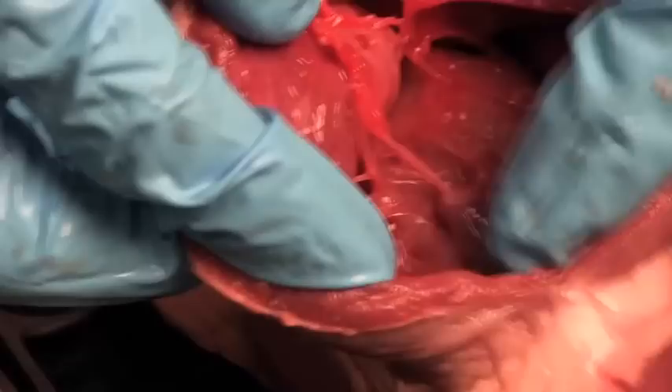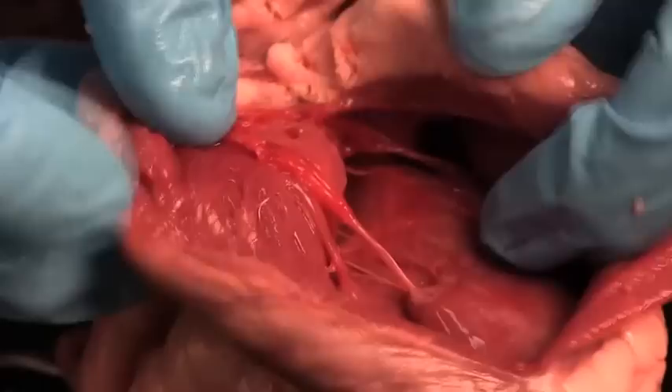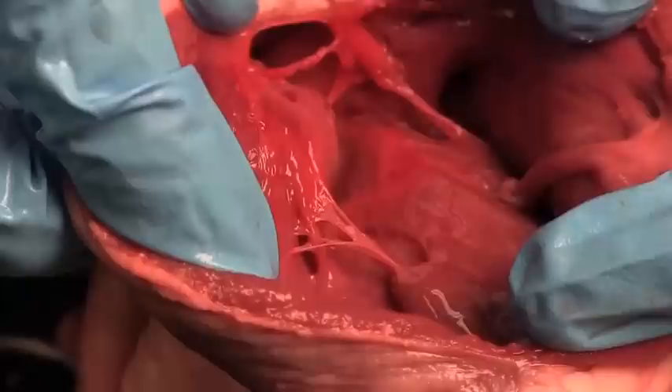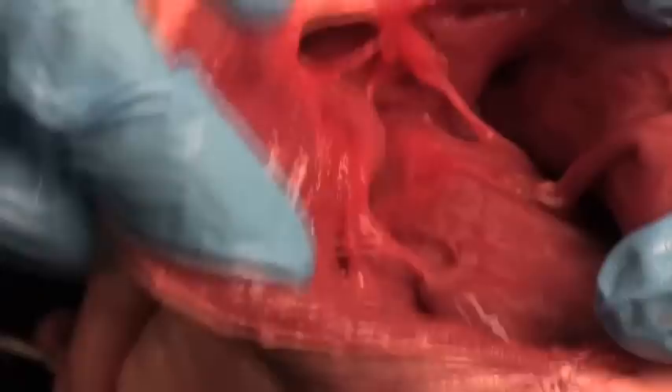Right here you can see some papillary muscles. I'm going to trim this so we can see a little better. You can see a papillary muscle that the chordae tendineae are attached to, and this one has got three little parachutes — one there, one there, one there. We call this the tricuspid valve. It's the right AV valve, and it's got three little parachutes — so tricuspid.